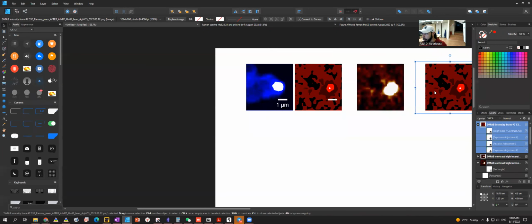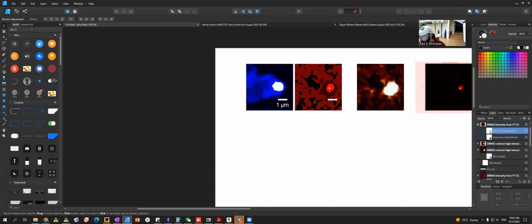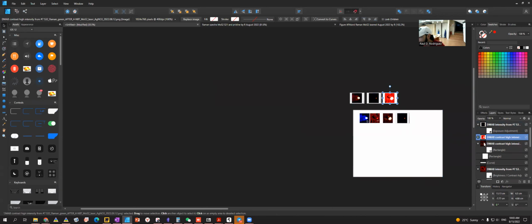I duplicate this one so I can pass the attributes, the presets and so on. You can either make it manually once again, or you can just pass them here. Which one is it? I'm modifying this one.